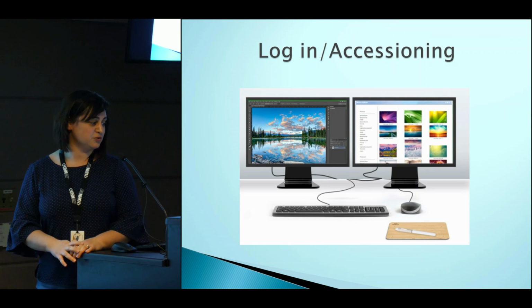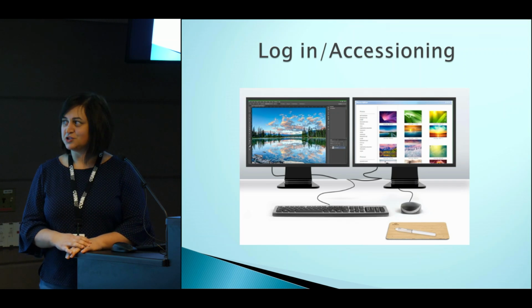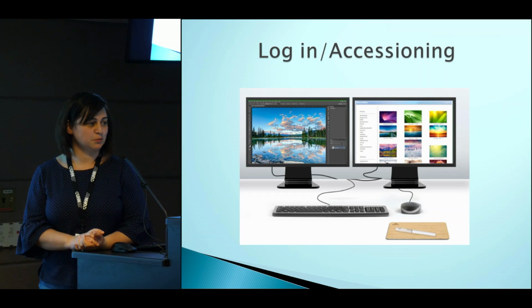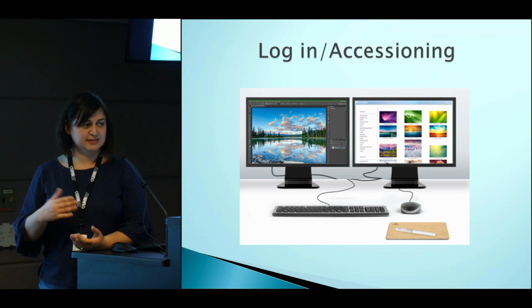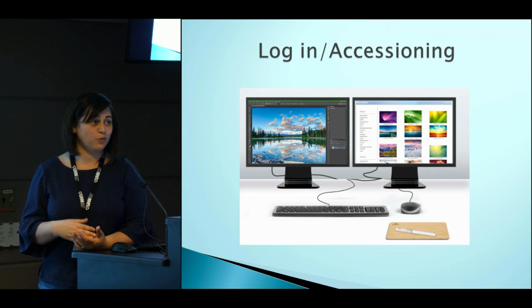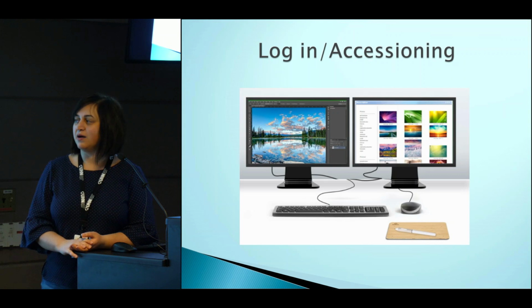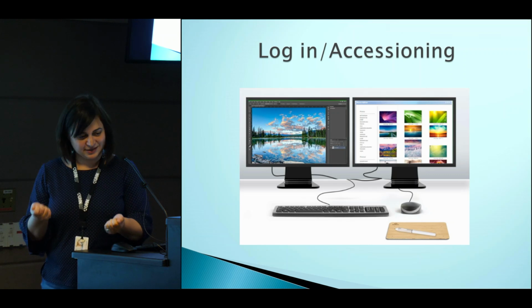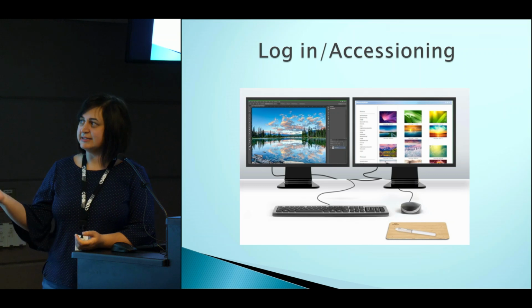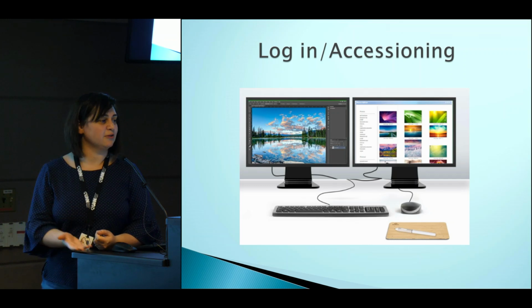So what we used to previously have was a login binder, and a technician would give a specific unique number and then write the details of the sample, like first name, last name of the patient, when it was received, type of sample received. So instead of doing this manually, like writing it down, we tried to go completely digital by copying that login manual into an Excel format.